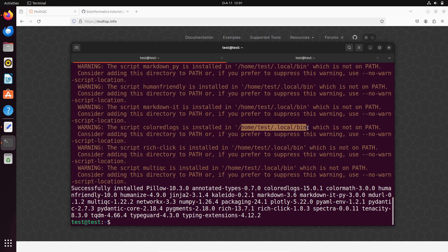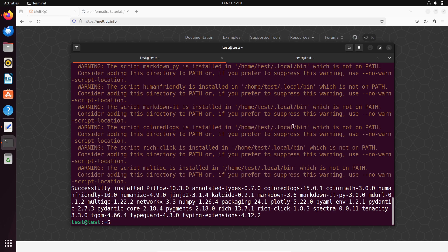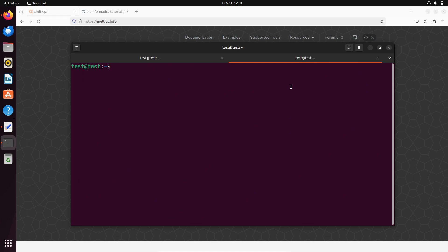We need to add this path to our environment, and there's another path we have to add as well — I'll show you everything step by step. You see '/home/test/.local/bin' — yours is likely different. For now I want us to focus on just up to '.local' first, then we'll go from there.